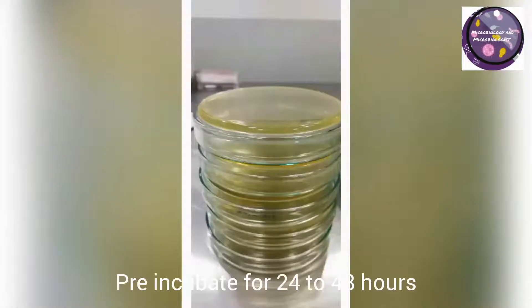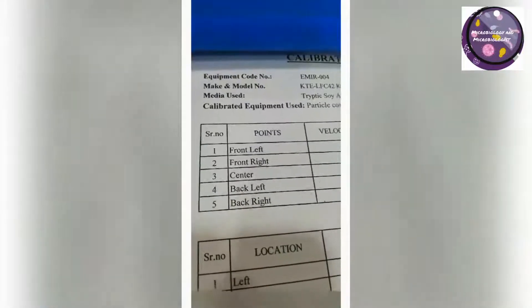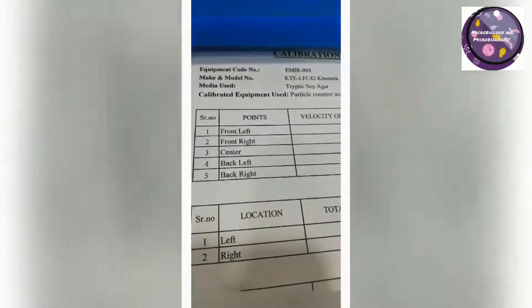I incubated these plates for about 2 days, meaning 48 hours. If you have a lack of time, you may incubate for 24 hours.